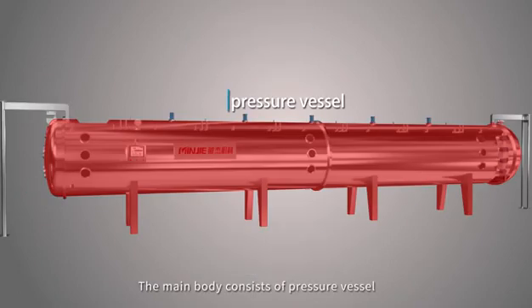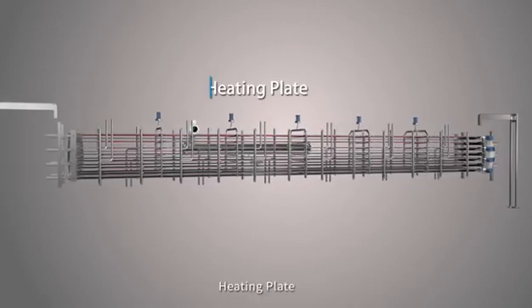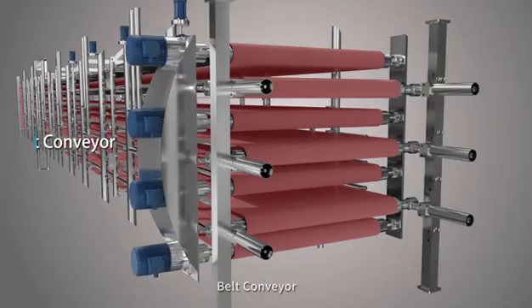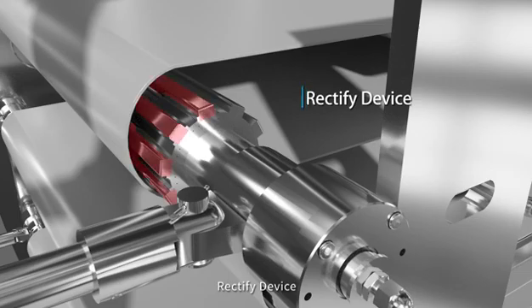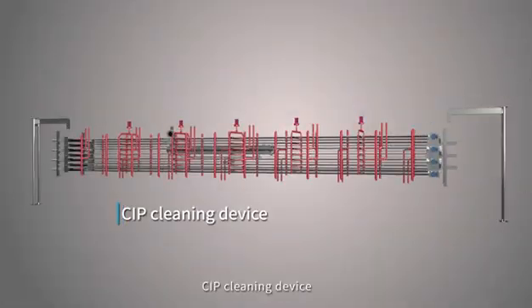The main body consists of pressure vessel, heating plate, belt conveyor, rectified device, and CIP cleaning device.